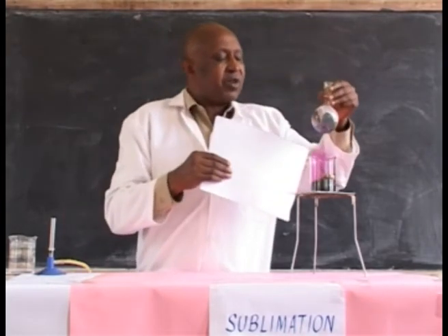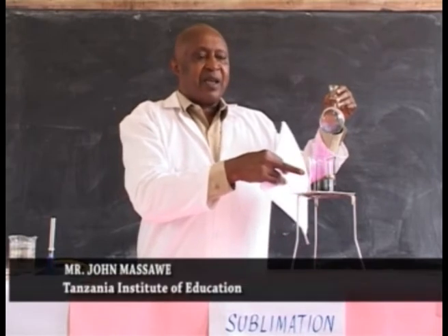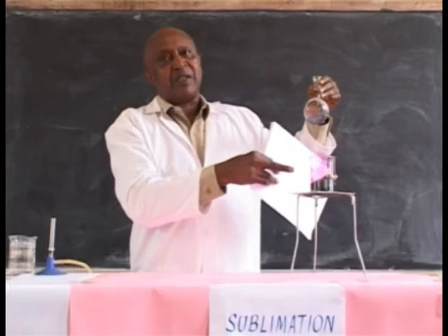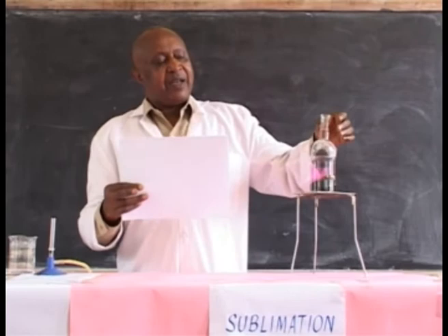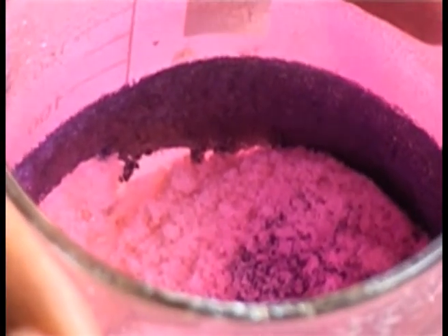The sodium chloride, which was in the mixture, has remained in the beaker, which contained the mixture. By so doing, iodine and sodium chloride have been separated.